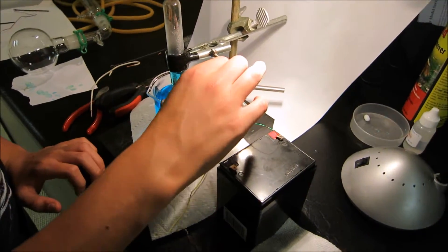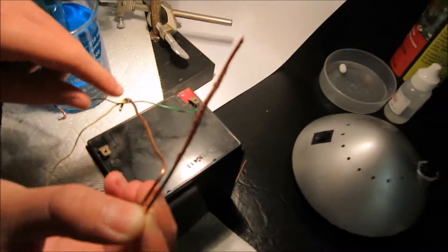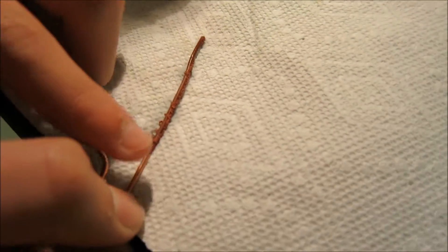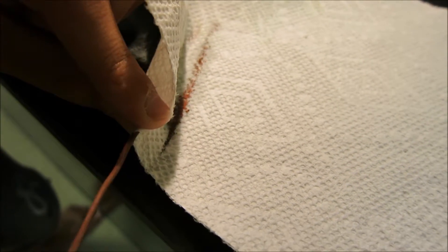So let's take it out carefully. The nail itself is actually quite warm. I don't know why, but it's heating up.